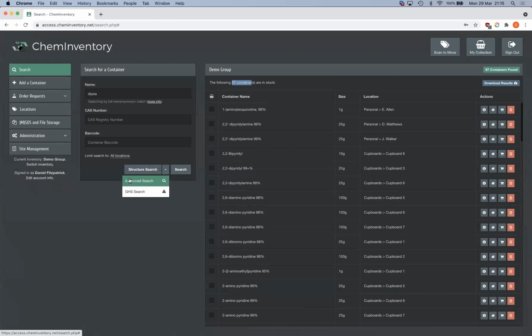Other search options we've got are what we call the advanced search tool, which enables you to build multi-component queries to run against your database. And so that really enables you to fine-tune your searching if you're looking for more particular restrictions, such as the example I mentioned a couple of minutes ago for date range. You can set a start date and an end date, and the system will find all relevant results within the two dates that you've set.